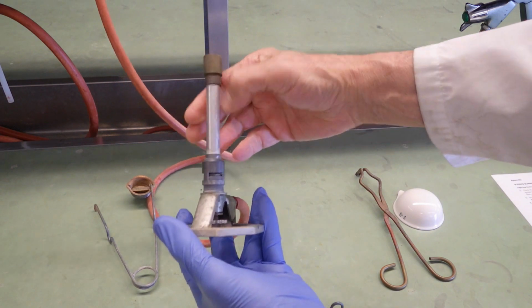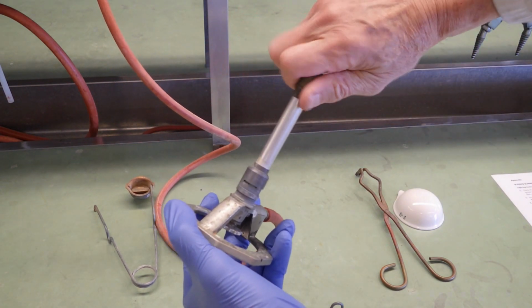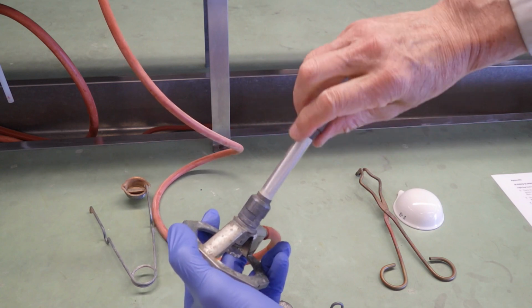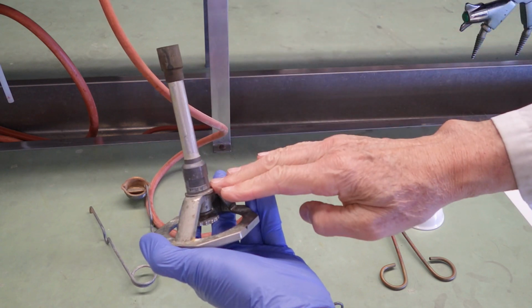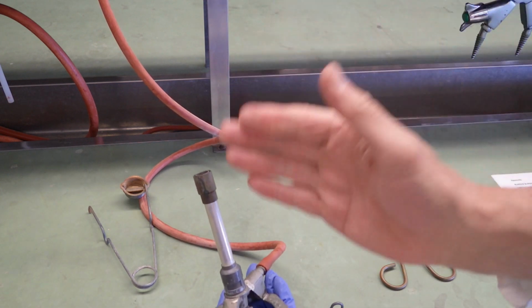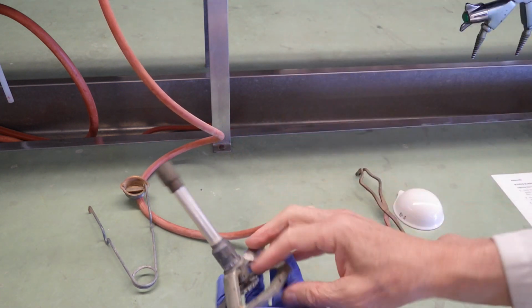Right, before you turn on the gas, close the barrel, rightsy tightsy. You want to eliminate air entering into the barrel of the burner, and that way it lights much easier. So that's closed, the barrel's closed. Now turn on the gas jet. Now I'm going to listen. I put this to my ear and listen.